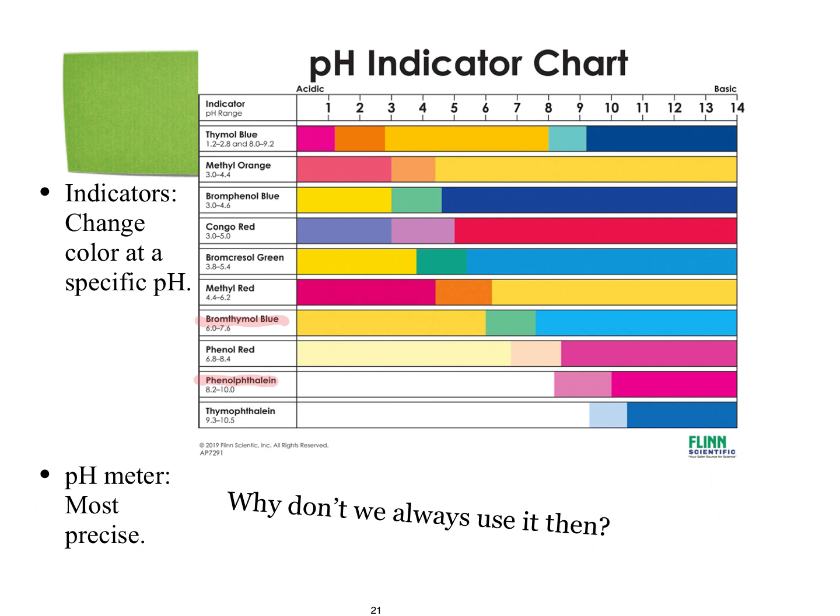They need to be recharged. They're particularly finicky. You have to store them in a particular solution, otherwise they get corroded and gross and unusable. And so pH meters are great, but they're a bit finicky, so hard to use.